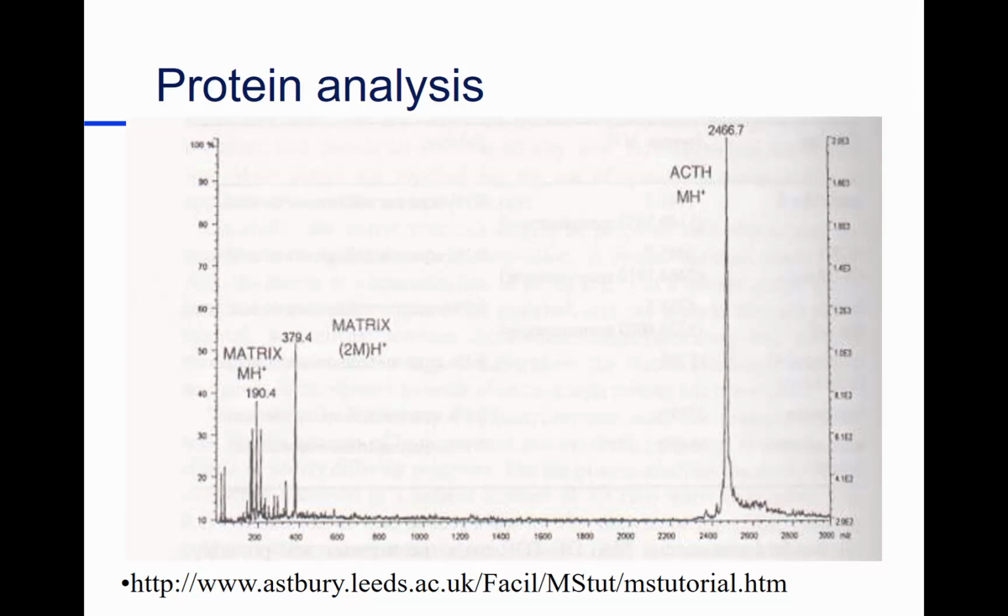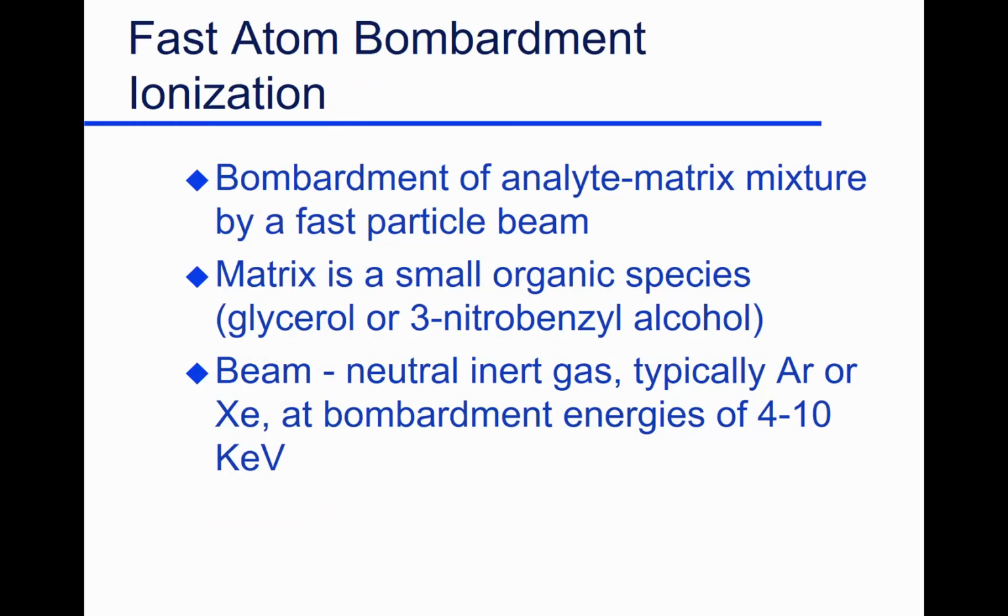Here's from the matrix. Now, if I were adding my flavor, I'd want to see this peak, and maybe a tiny one for benzaldehyde being added to it, or 2 benzaldehydes, or 3, or 4 flavor molecules. Then we'd start understanding a little bit more about the problem of how flavors interact.